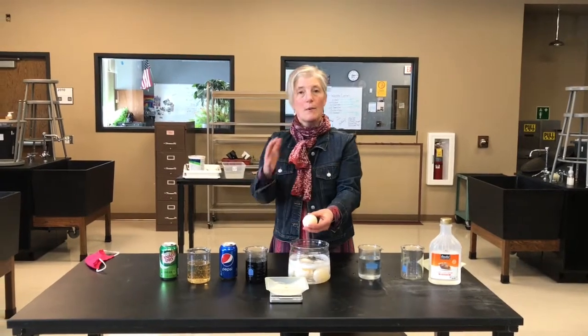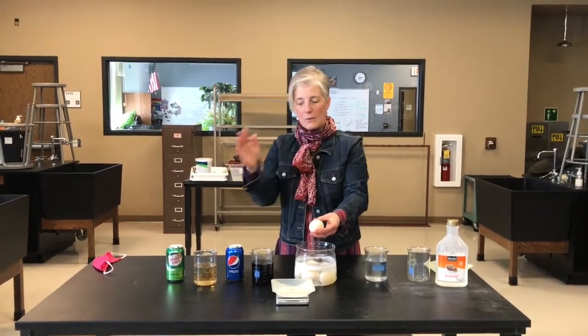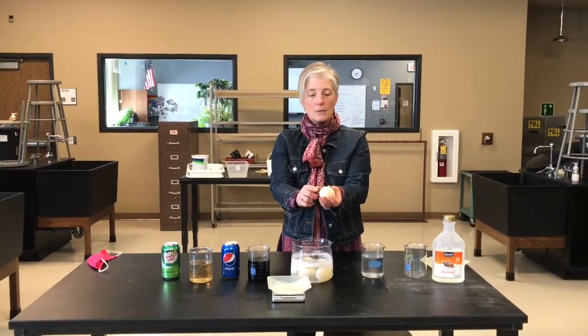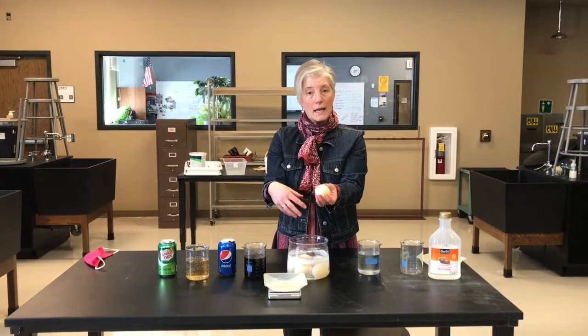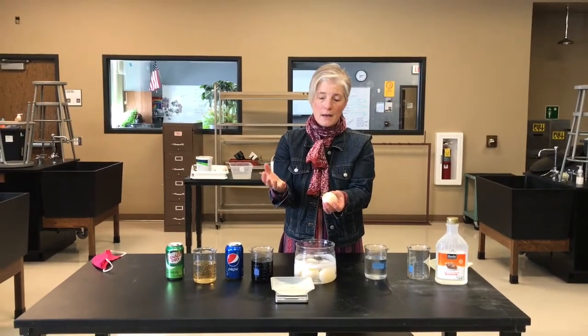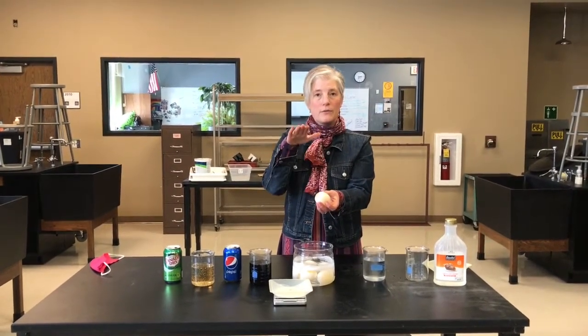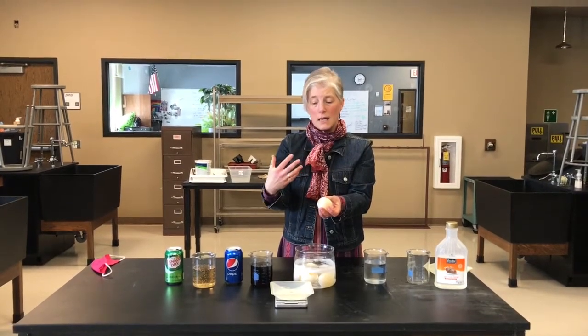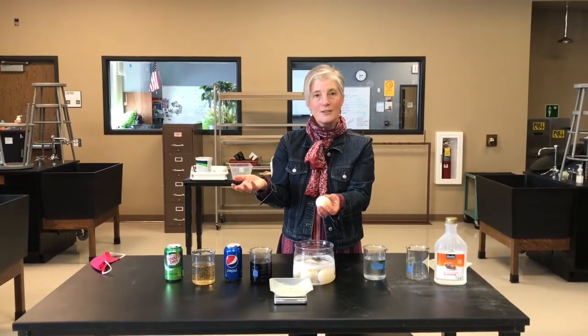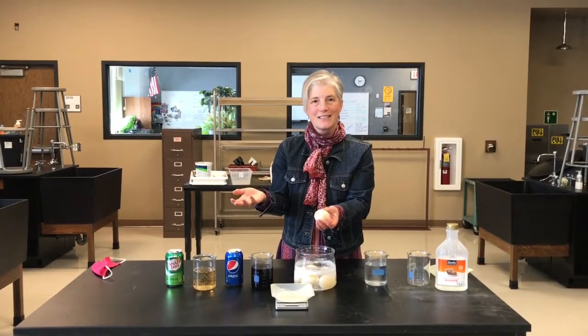So we're going to weigh before, and then we'll weigh after and see if our poor little squishy eggs lose water or gain water. Your job is to make a prediction, see what's going to happen, and then make a bar graph so that you can show us in real time the results of the before and after and tell us the conclusion. Good luck. Let us know if you have any questions.